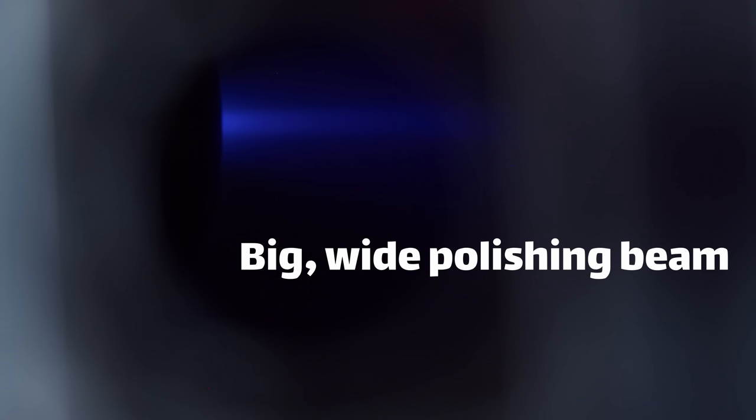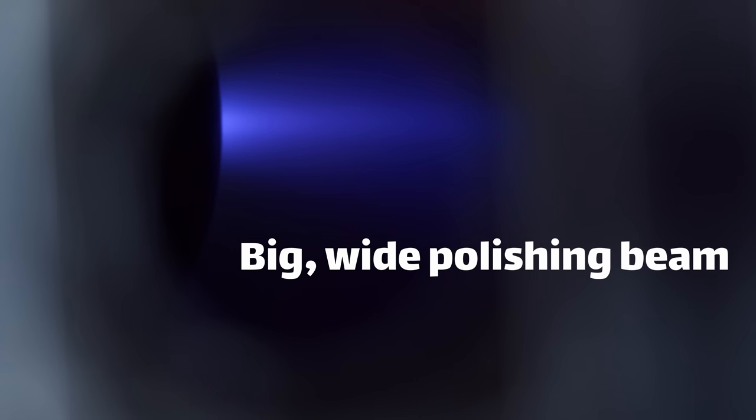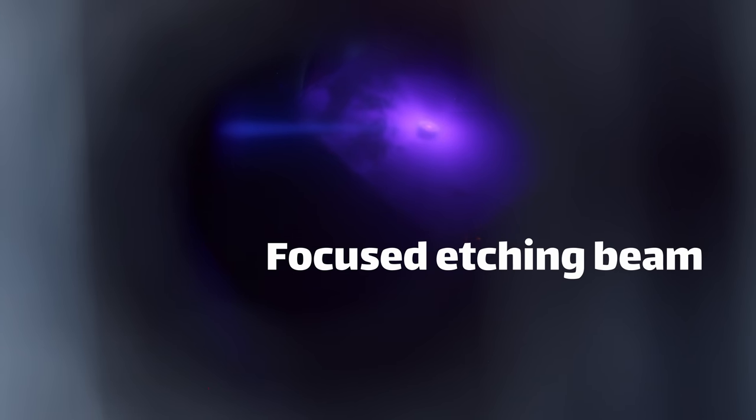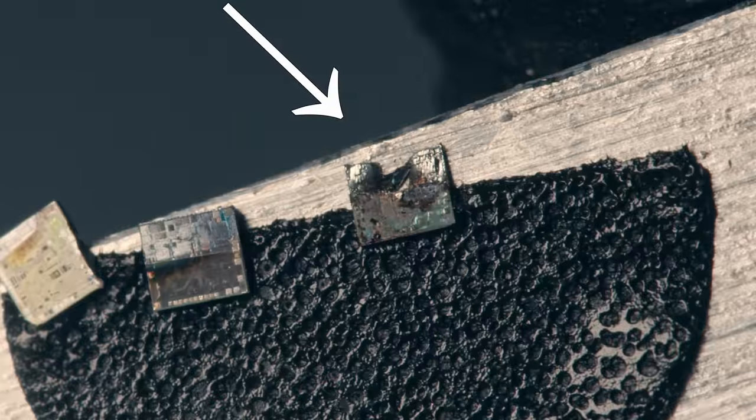Depending on how you configure the machine, you can get anywhere from a very gentle polishing effect all the way up to very aggressive etching. And if you're a little too aggressive with it, you can accidentally blast holes straight through your sample. So how exactly does all this work?